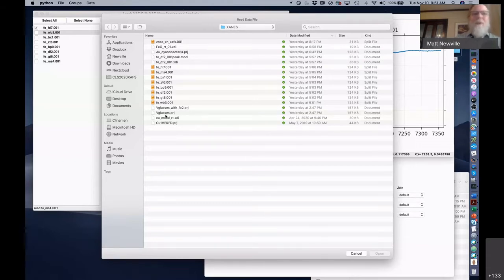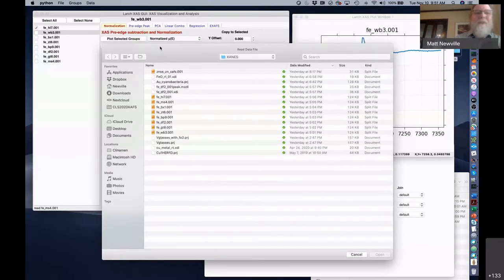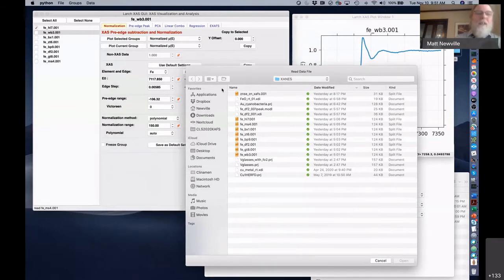But this program right now reads text files, and I've been contacted by several people over the last, say, 6 months or a year even, about trying to get a standard reader for HDF5. And I think that's doable, but right now that's not working. Anyway, that was going to come back to. That's also to say that the reference channel, I don't know if a good way to encapsulate this is always a reference channel.